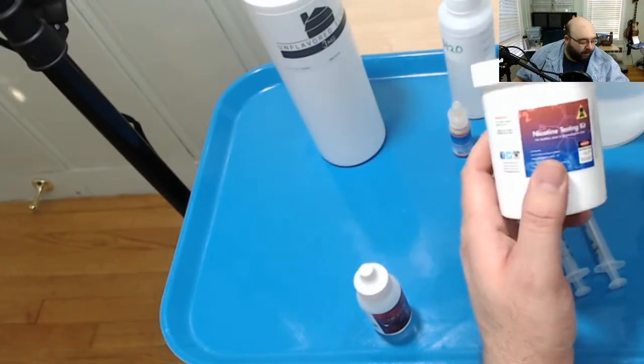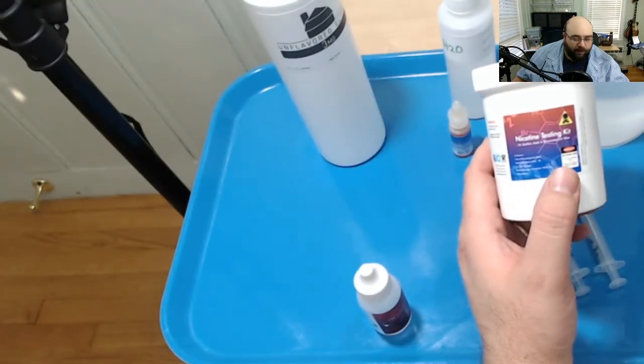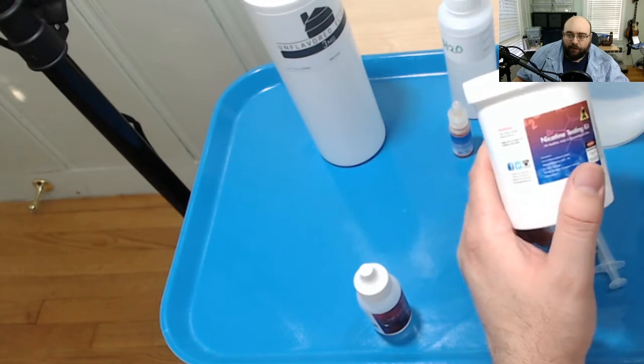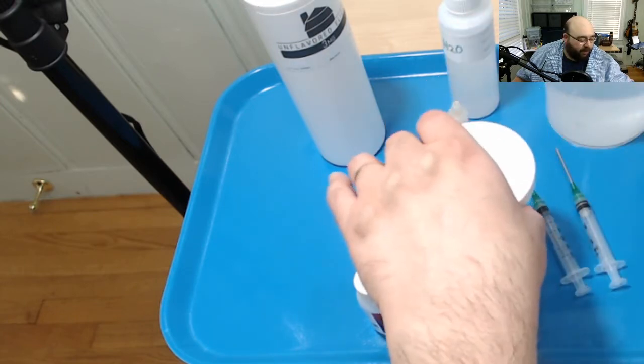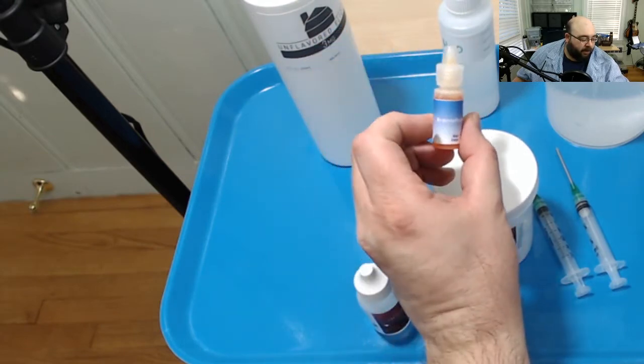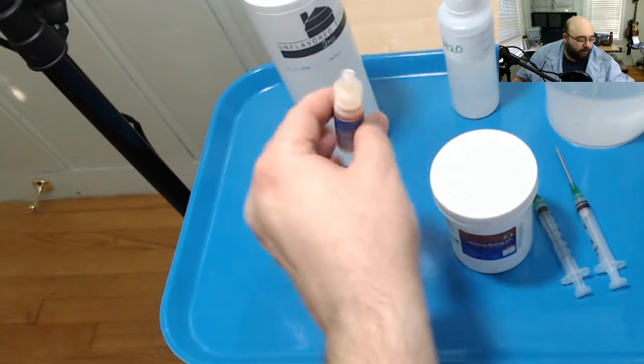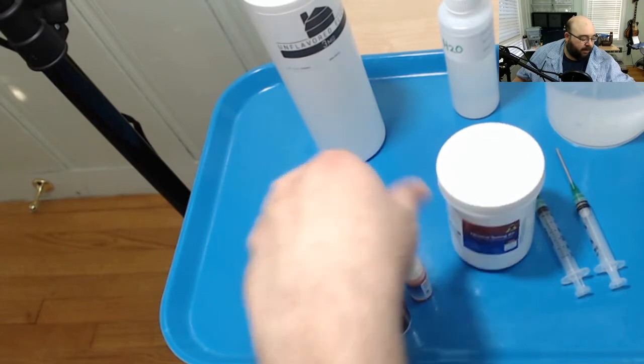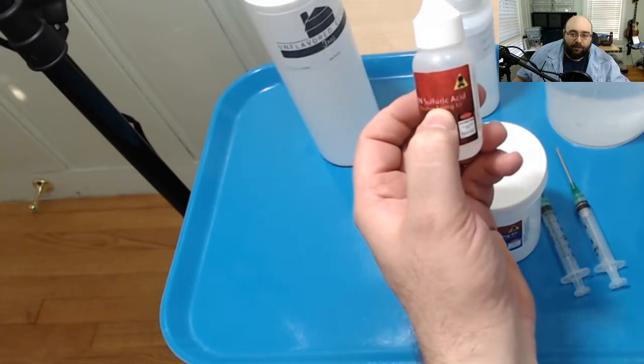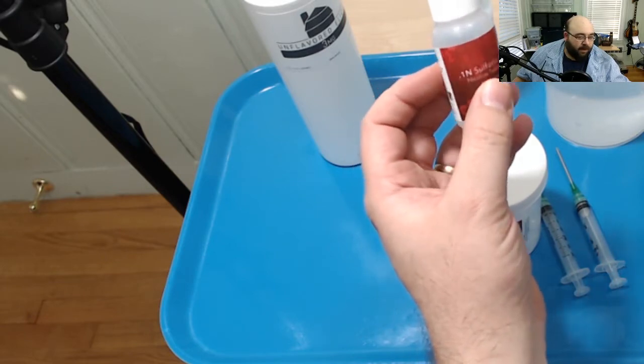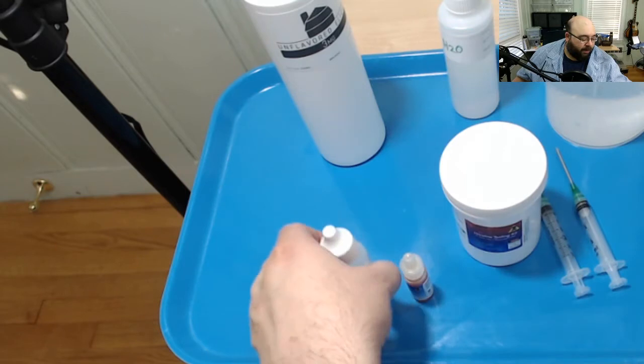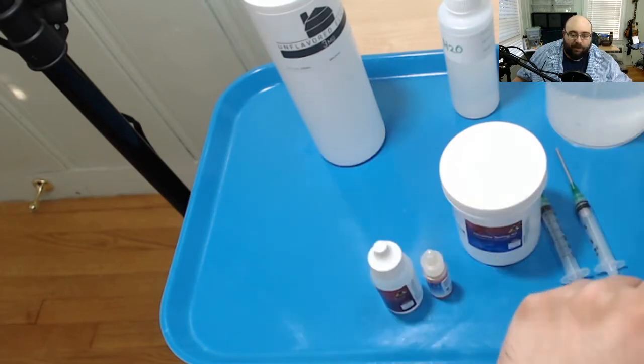So I'm using this test kit that I got I think from ECX, yeah from ecxpress.com. It's basically this cup and a small container of bromothymol blue and a container of 0.1n sulfuric acid. And you can pick these up individually or you can pick them up at almost any place that sells nicotine should have a test kit.